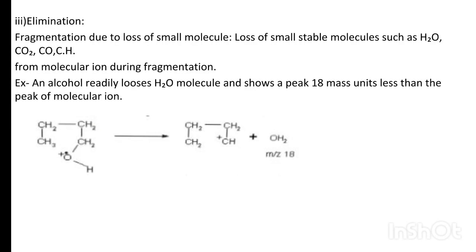Third one is elimination. Fragmentation due to loss of small molecules, that is loss of small stable molecules such as H2O, CO2, CO, CH from the molecular ion during fragmentation. Example: an alcohol readily loses a water molecule and shows a peak 18 mass units less than the peak of the molecular ion.